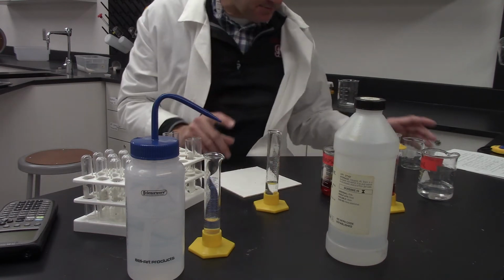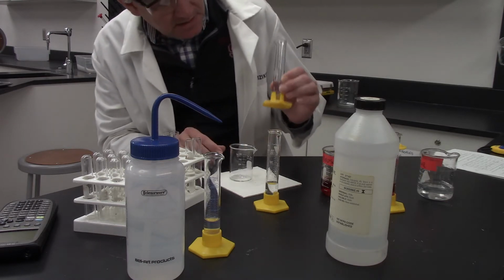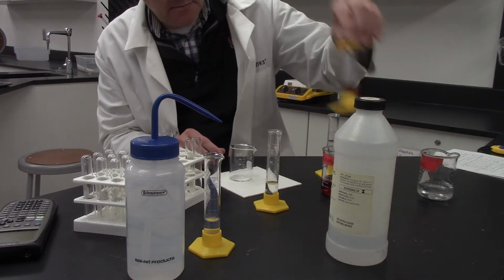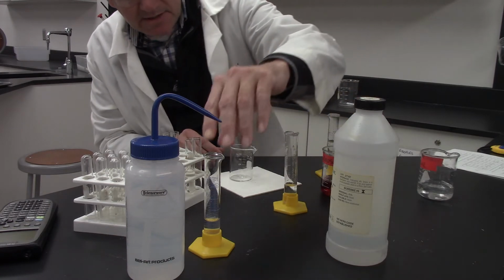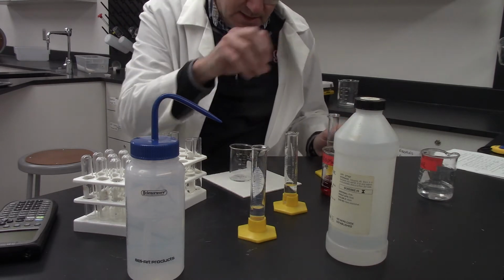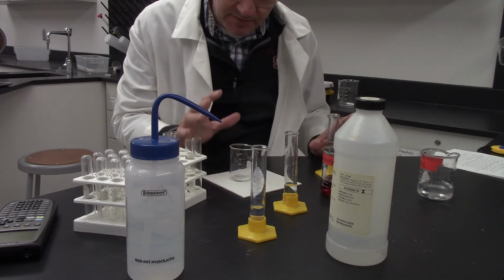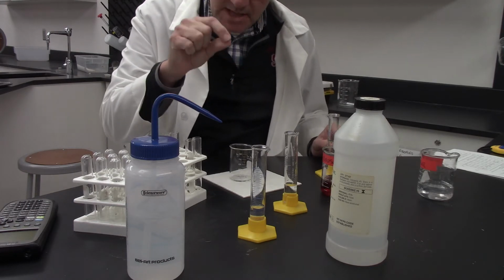So here's going to be my procedure. I've already got everything measured out. I've got my 20 milliliters of acetone. That's why I said we're going to run the second reaction. I've got my 10 milliliters of iodine, 10 milliliters of my hydrochloric acid, and then 10 milliliters of water. If we add this all together, 20, 10, 10, and 10, that adds up to 50. So the total volume of this solution is going to be 50 milliliters. That's going to be important when we calculate the concentrations after they are mixed.